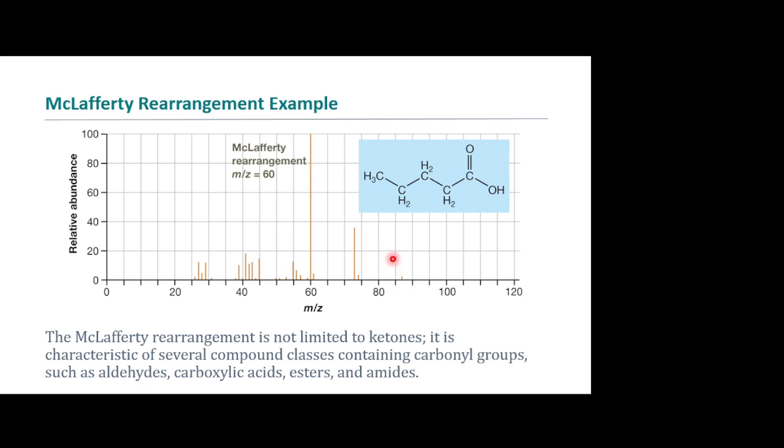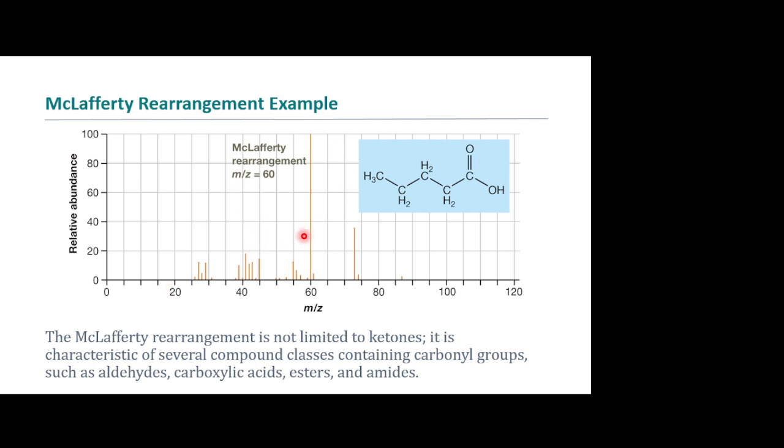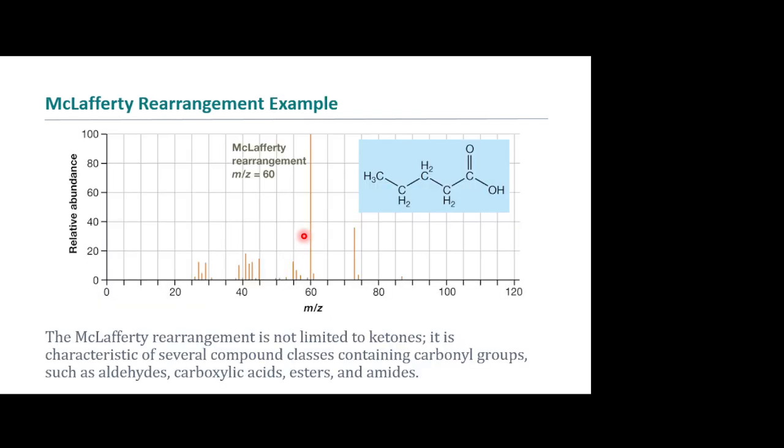Okay. And so that's a 37 difference. This one was that amount of loss because of the loss of these extra carbons. Oh, okay. Yeah. So it'd be the specific number of carbons that you've lost here. Okay. And so what we would always end up with is a multiple of the CH3 plus CH2s being lost.